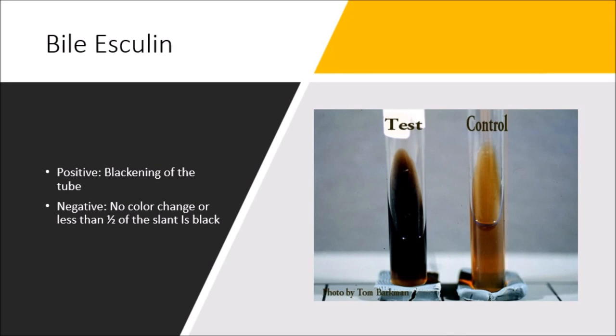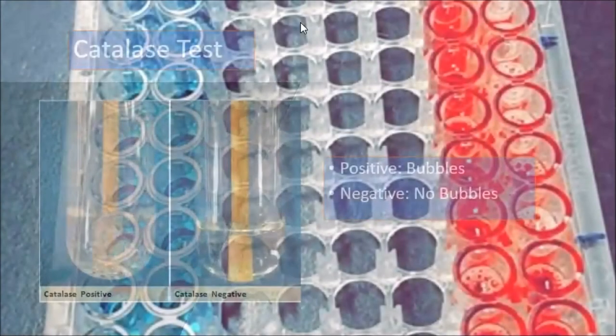The purpose of this test is to differentiate microorganisms based on their ability to hydrolyze esculin to esculetin and dextrose. The esculetin reacts with ferric citrate in the medium to form a dark brown-black complex. If you look here, this would be a positive result, which is the blackening of the tube, and then you have your control, which is little to no blackening.